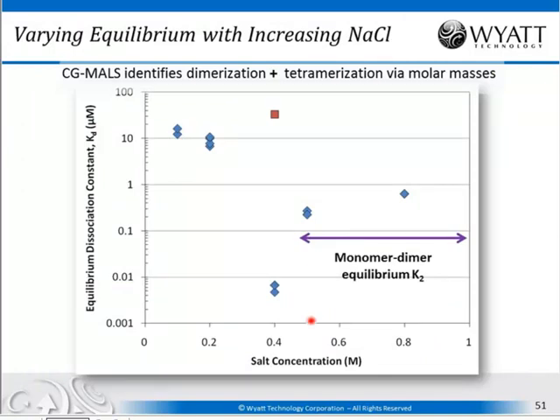We found that at larger salt concentrations, in fact, the dimerization does depend on the salt concentration. And so there's a monomer-dimer equilibrium, which gets weaker as you increase the salt, hence explaining the lack of activity as you increase the salt concentration.